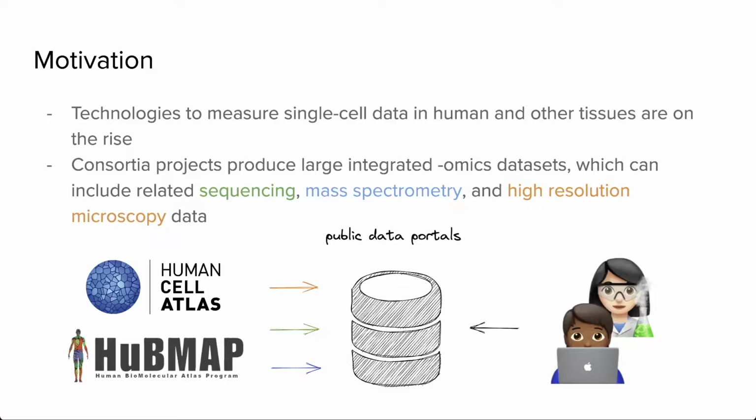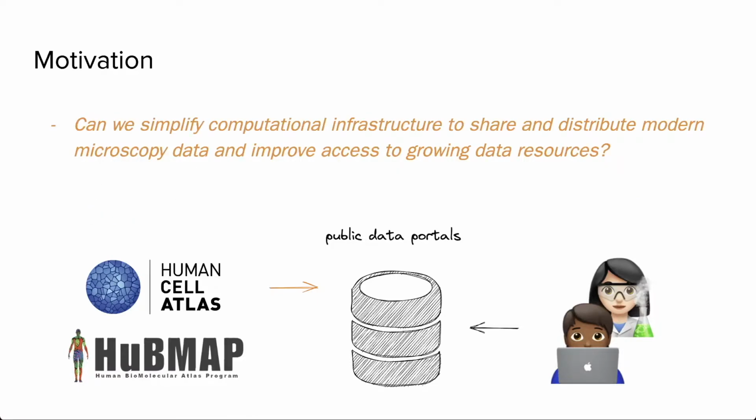We want to empower end users to browse, explore, and analyze these data with ease. Today, I'll be talking about some of our work with high-resolution microscopy data and thinking about how to design these data portal client applications through our web-based technologies. So to reiterate, our goal is to simplify this computational infrastructure so that data providers can focus on sharing the data, and then we can build computational tools that interface with those data portals and provide easy access to end users.